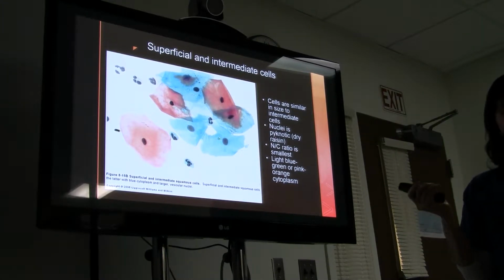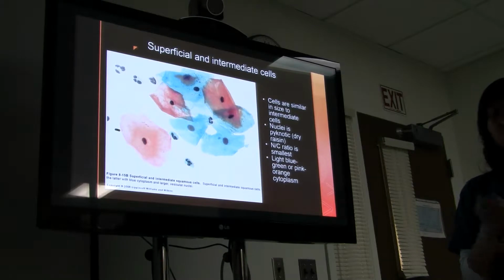Do they have a high NC ratio or low NC ratio? Low. Low, okay, very good.